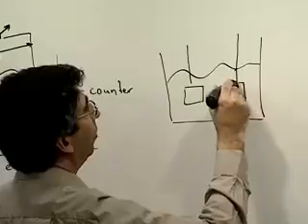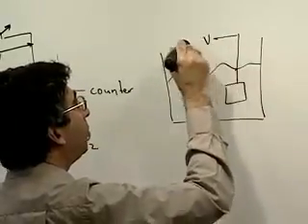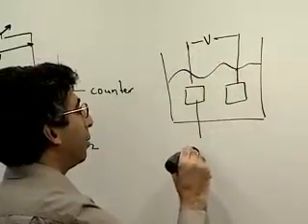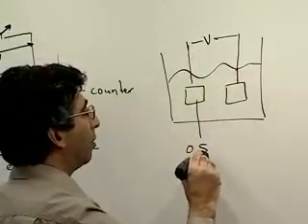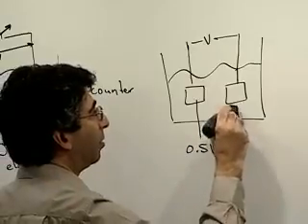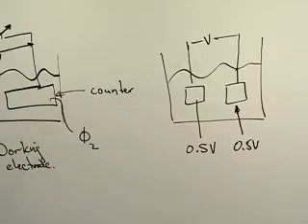They're identical, believe it or not. And now when I drop a voltage across them, in fact, it does distribute evenly. Whatever voltage I drop there, half of it goes there, and half of it goes over there, for a very, very short period of time.